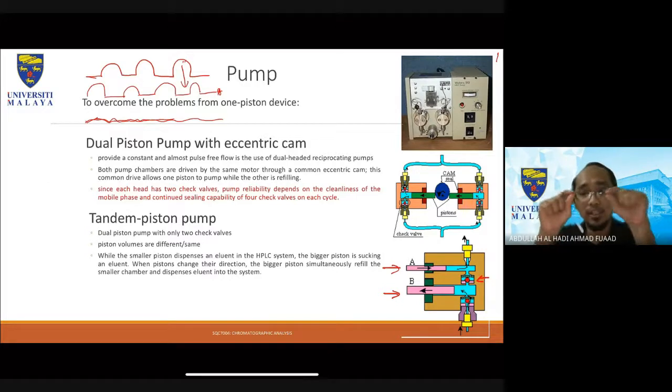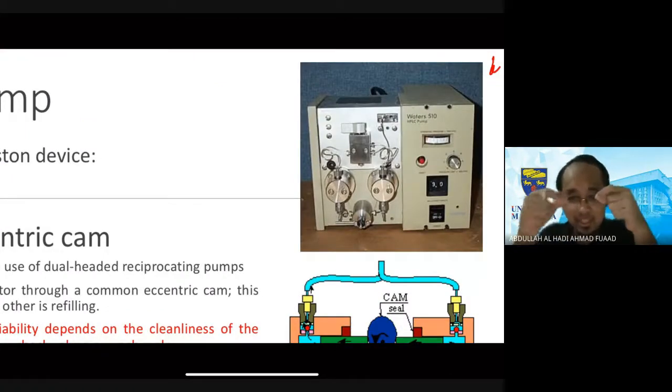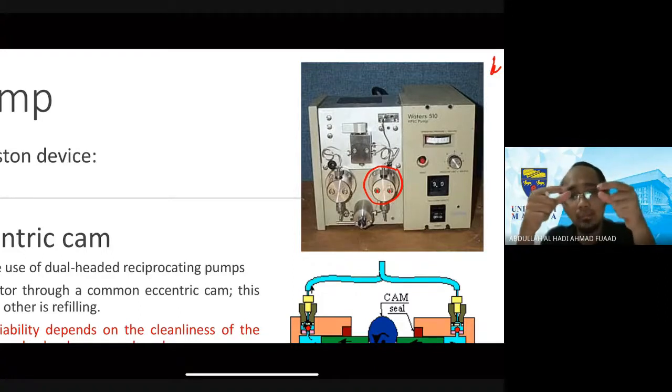Okay, so you can actually see two kind of buttons moving, not buttons, it's actually the pistons moving back and forth within the pump. So imagine that if this is the pump, you can actually see, I recall it's something like that. So it's moving back and forth, but one of the piston pumps actually moves faster than the other. Okay, just to complement.